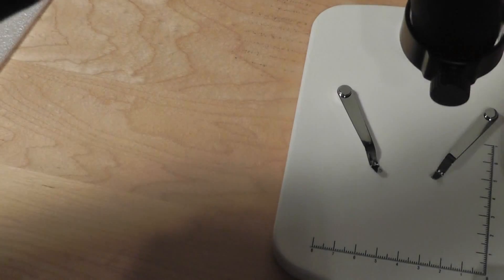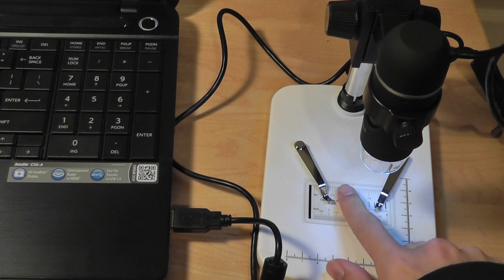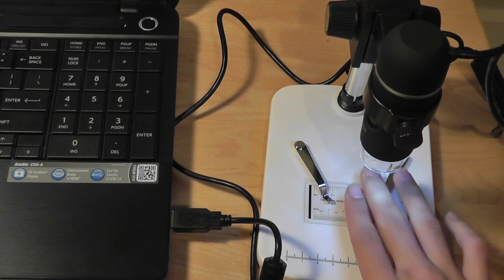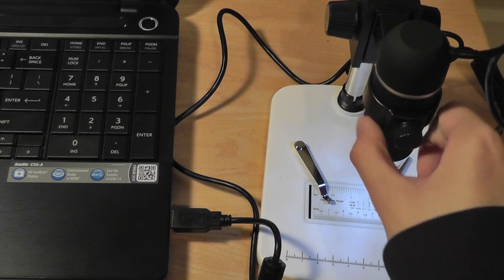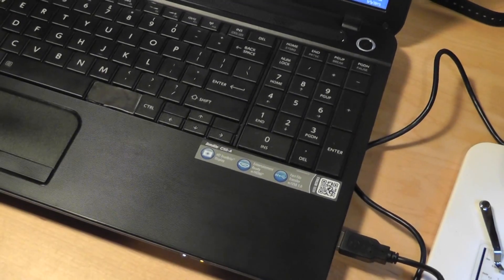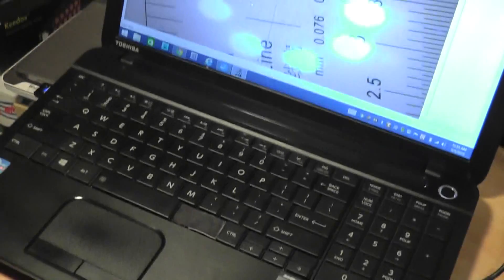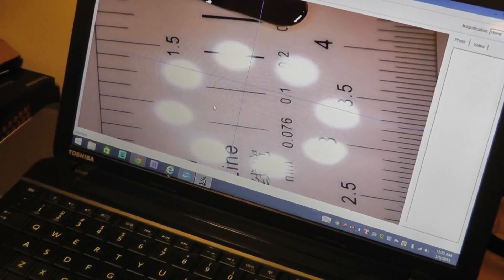You simply fasten the microscope into place, and the other end just goes into your computer. Once it's connected, you can see the lights will be illuminated. We have the calibration sensor over here, but you can basically place anything on here and then use the microscope. You simply adjust the dial on the side to get your desired image into focus, so it's not too terribly difficult to start using it. The program is also very simple and pretty easy to use.